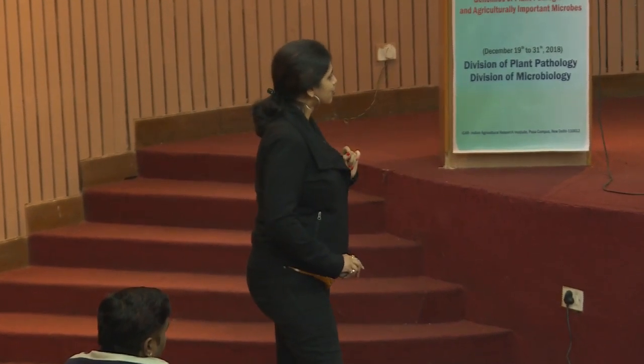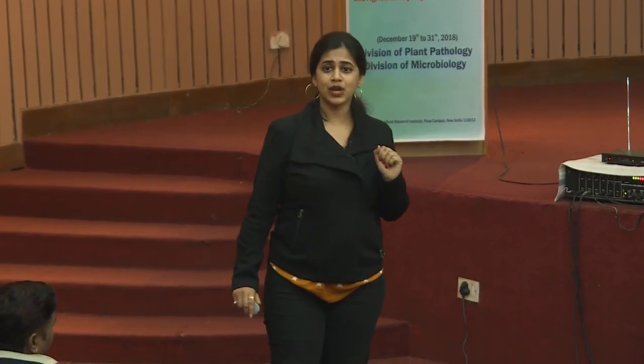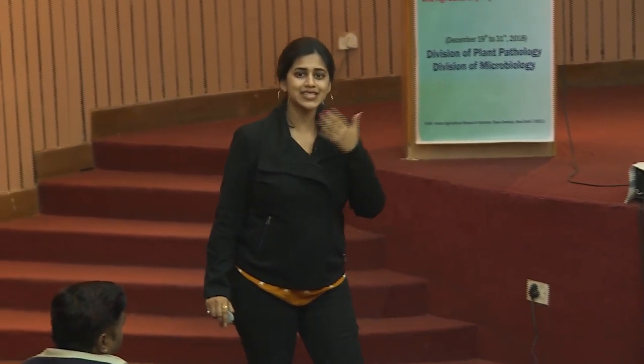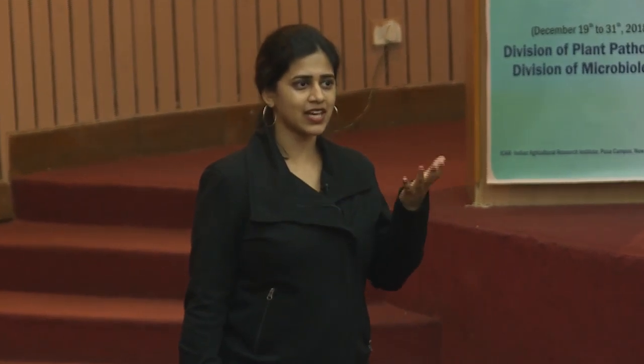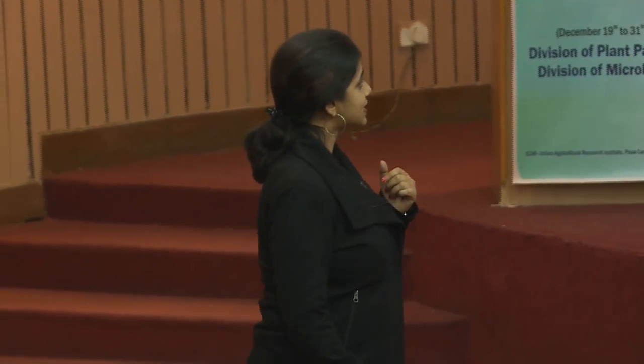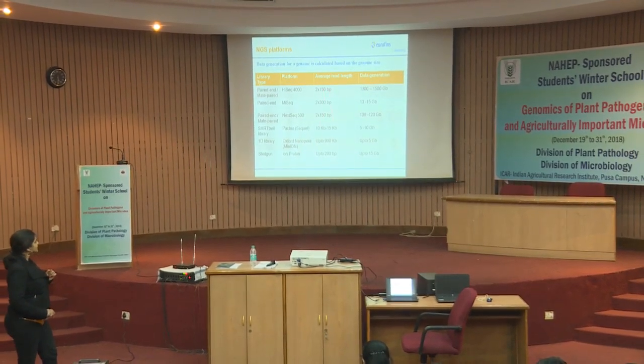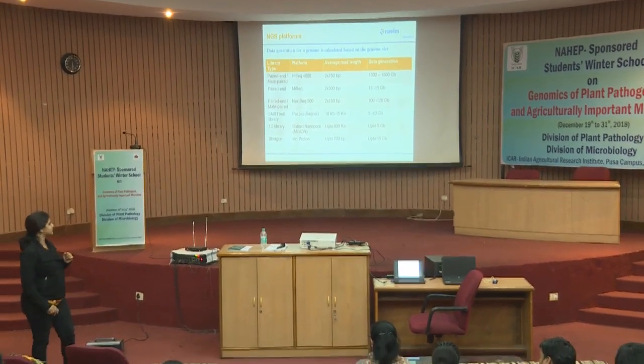We also have a new chemistry coming up in this MinION. The new chemistry has improved in terms of the error rate, but the error rate is still somewhere around 10%. That is a huge number, whereas the error rates in these are 0.08% only. So, that is the difference in the error rate of these chemistries, right. So, we combine these chemistries together for doing sequencing.